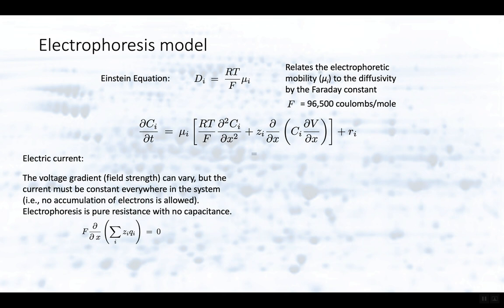It's something that limits almost all electrophoretic processes in how readily they can be scaled up, or how far they can be scaled up. If you get too hot, the electrolyte solution can boil, and if it boils, it creates a bubble in the solution, and the ion mobility stops and the circuit shuts down.